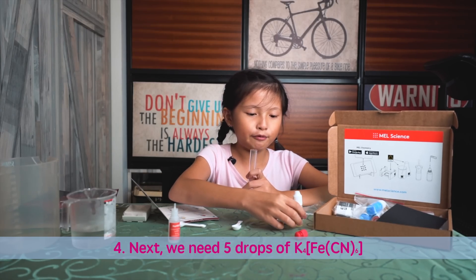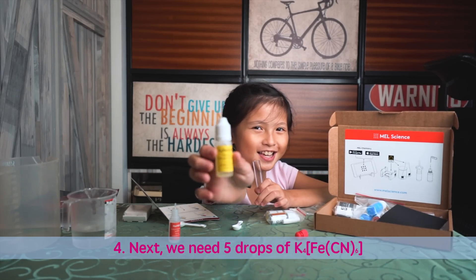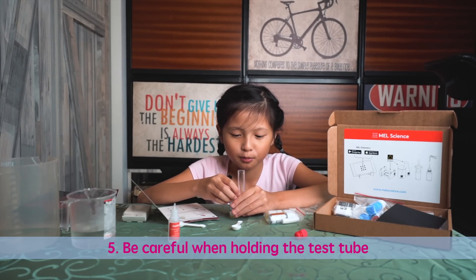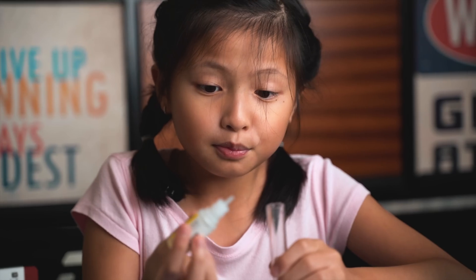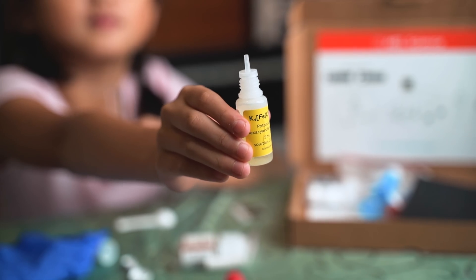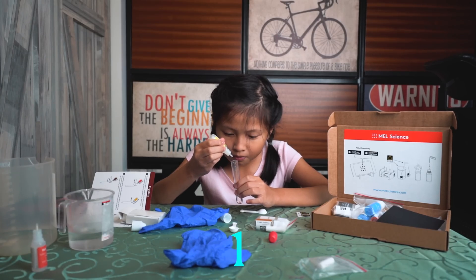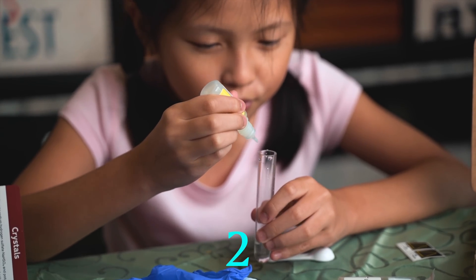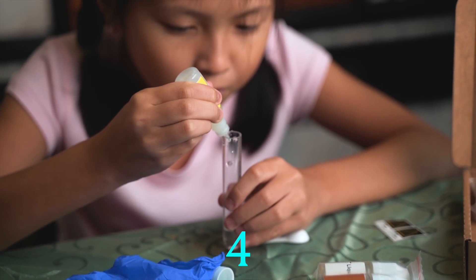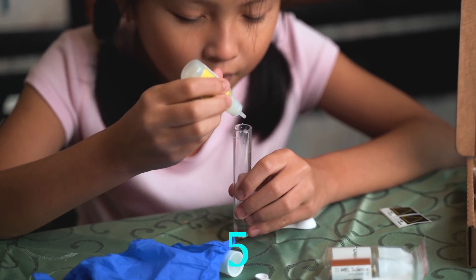Next, we need five drops of this. Remember not to drop your test tube or it will go everywhere. We need to put five drops of this: one, two, three, four, five.